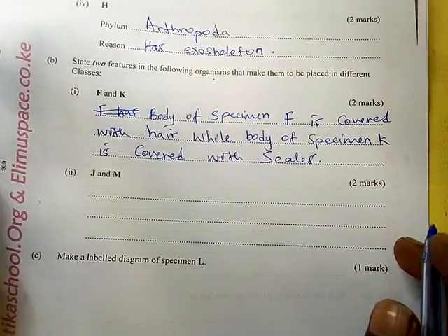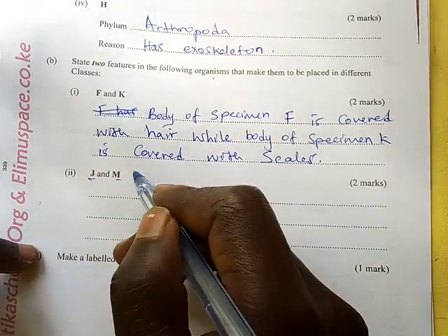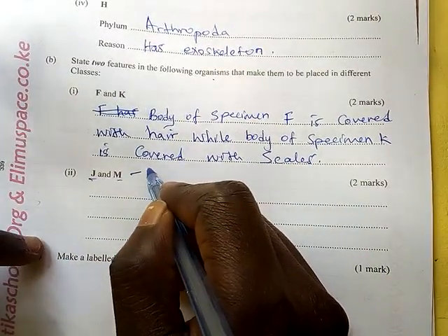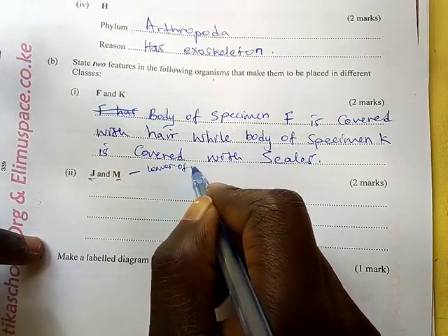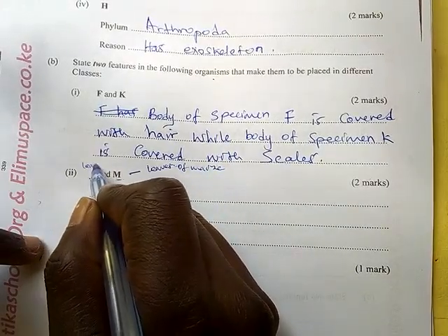Now J and M, they were given. This M was maize, leaves of maize, while J was leaves of beans.